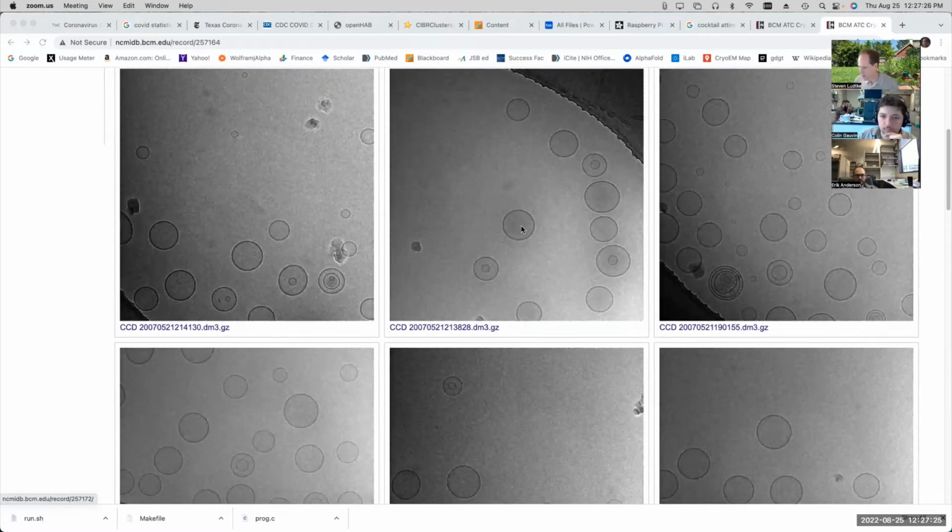So the other thing to be aware of is that in a real lipid vesicle, while there is a little bit of overall contrast difference because of the phosphate versus water background, there's also a lot of variability in the texture of the lipid bilayer itself.